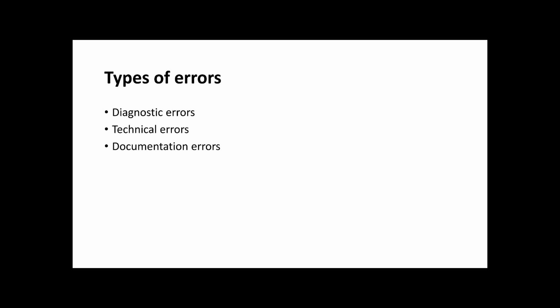Most of the time, there is little or nothing that can be done to rectify an error once a smear has been prepared, and with limited material, this is something to keep in mind.